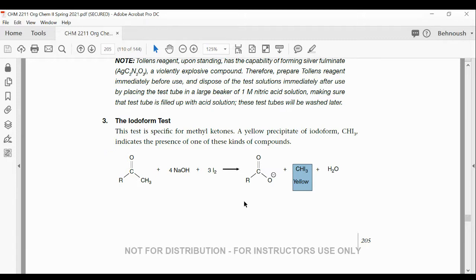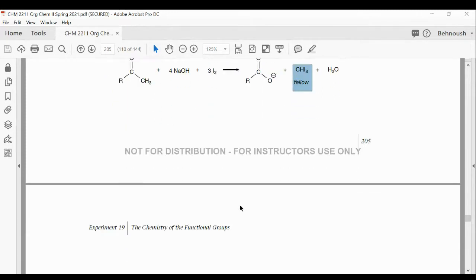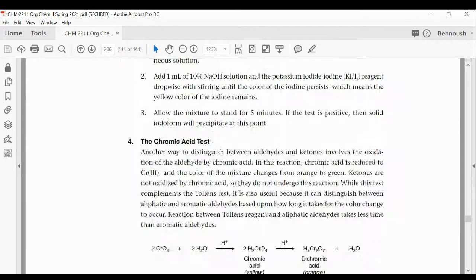And then you use a combination of physical properties, chemical properties, and classification tests in order to match that compound with one of the compounds in the list at the end of the lab manual, which you would use for the unknown compound. We are not doing unknown identification for this experiment, even though we have the procedure. But when you start with your unknown, you come back to this page and you can use the procedure for your unknown identification.